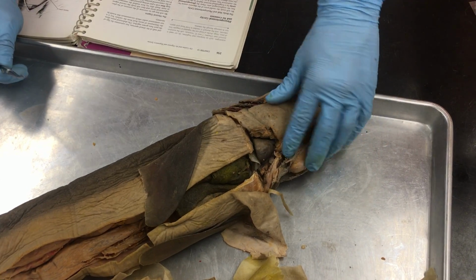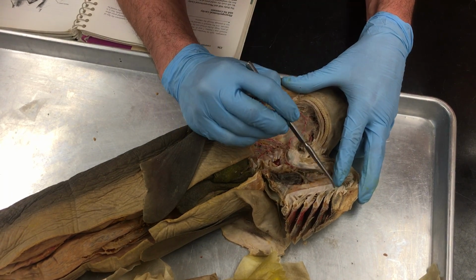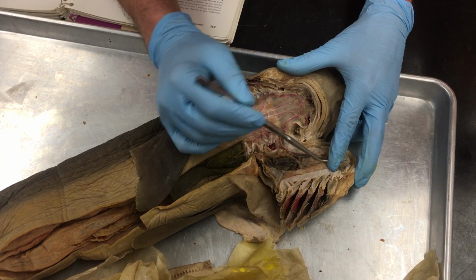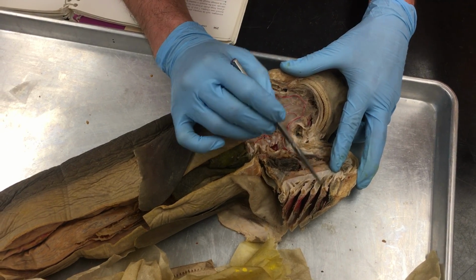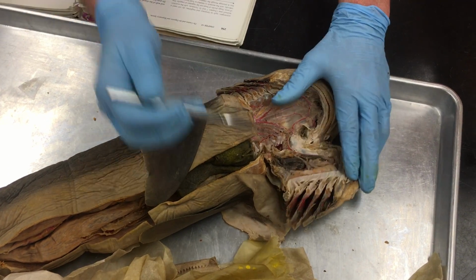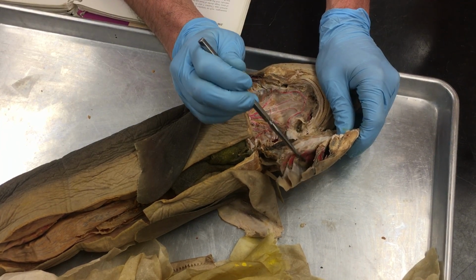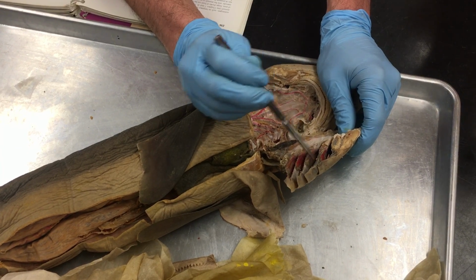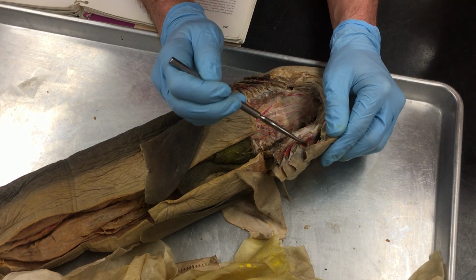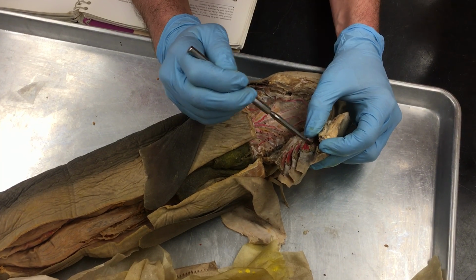So those should be gill rakers. These, they pretty much project perpendicularly to the gill arch. So gill rakers, gill arches, the cartilage that the gills are on. Branchial pouches, just the space in between gills. Gill lamellae, the red and brown parts. So the actual part of the gill that does the gas exchange.